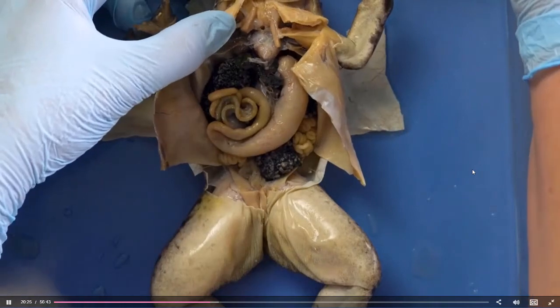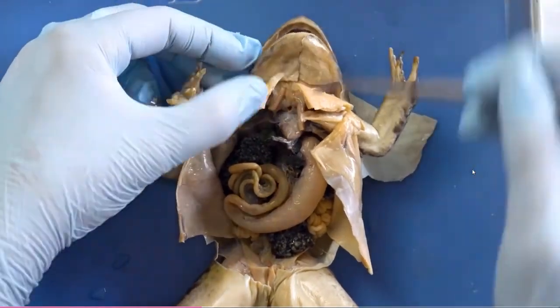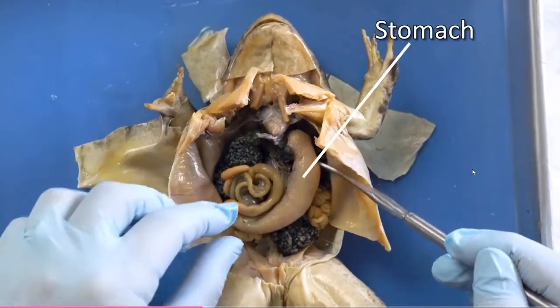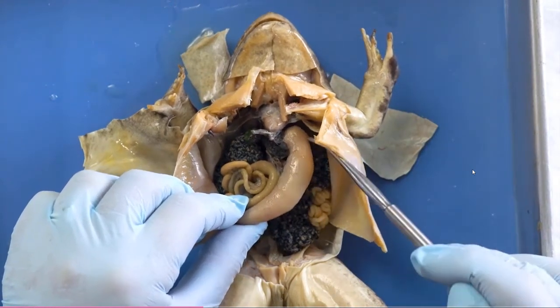If I take my probe back up into the esophagus and I follow it down, I will find that it leads to the top of the stomach right here. Here's the stomach of the frog. We notice this shape of it.